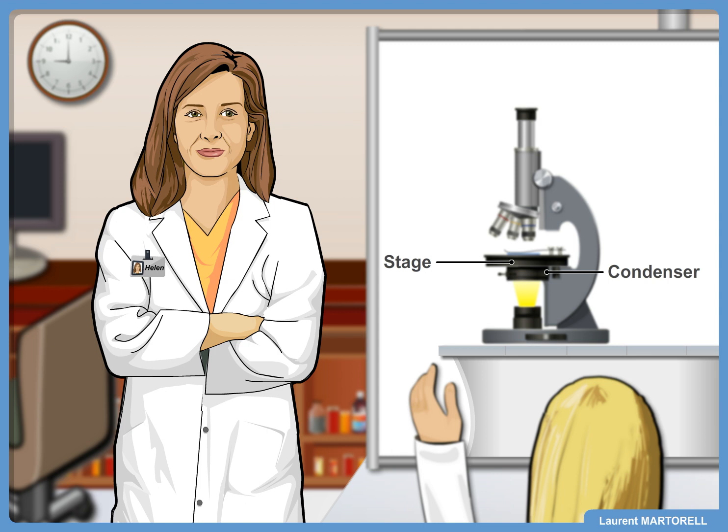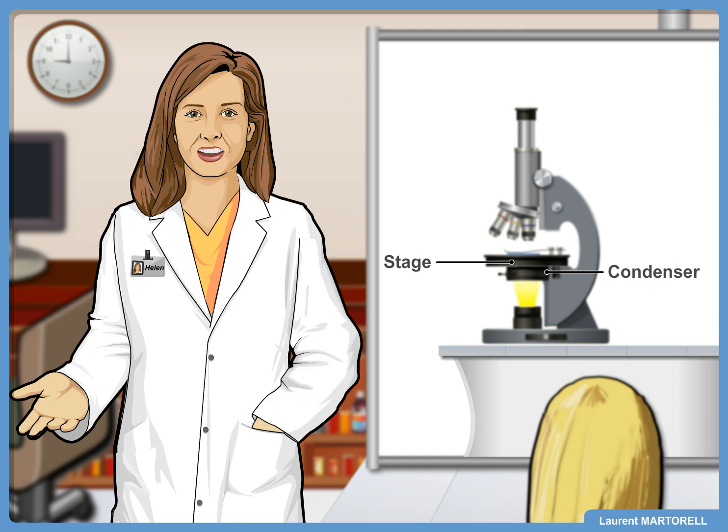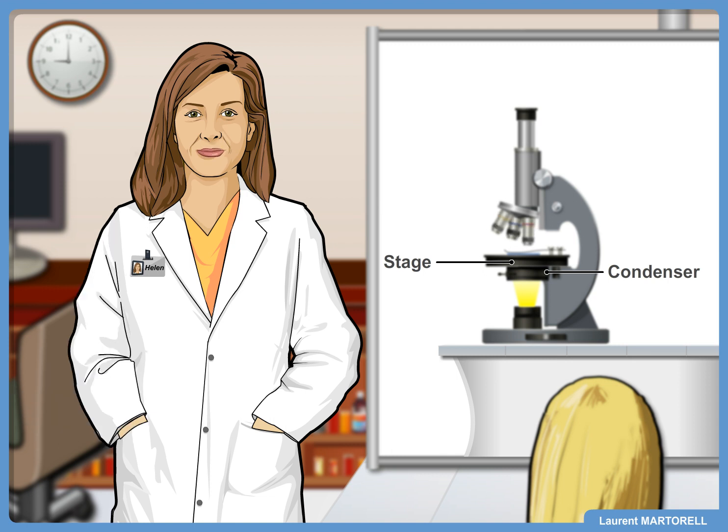To zoom in or out, revolve the nose piece—it means rotate the nose piece. This is how you can switch from one objective to another. Notice this is why the nose piece is called the revolving nose piece.